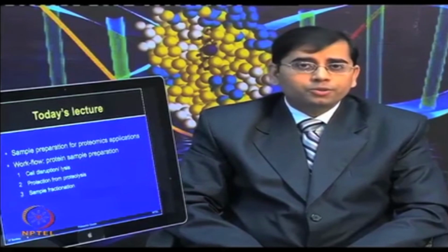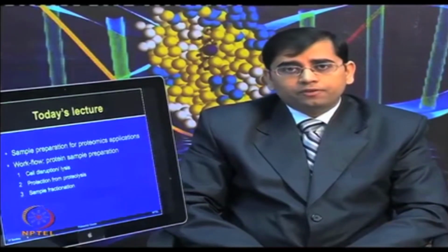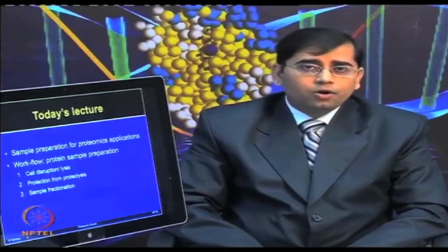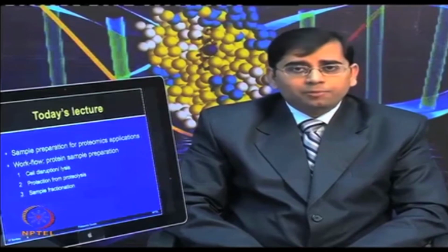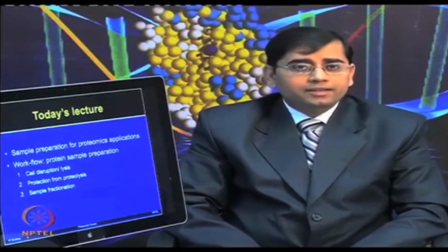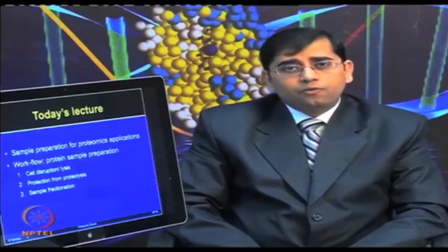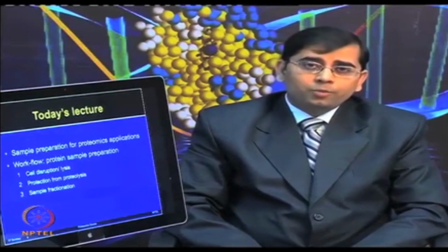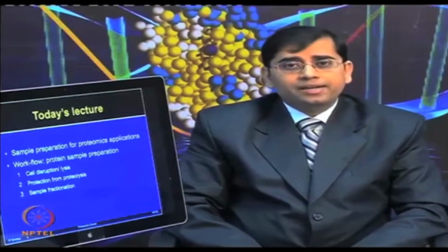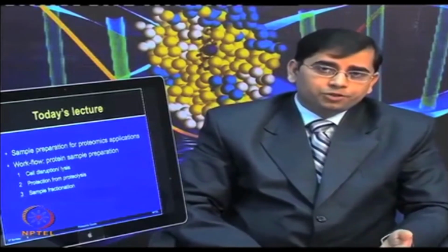So, whether you want to use two dimensional electrophoresis, dyes or different types of gel based applications, or you want to perform mass spectrometry and different types of label free techniques, you have to ensure that you are starting with a very good protein extract. But sample solubilization and some other components are added more when you are performing the gel based proteomics.